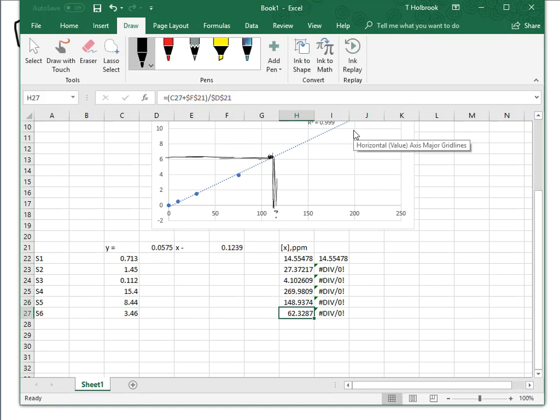All right? So don't let that catch you for a loop. Don't let that throw you off and cost you tons of points because you weren't clever enough to go in and anchor those numbers. Now, you can manually put them in. You can go down through here and manually type in that calculation every single time. Take this number, add this number, divide it by that one, hit enter. In the next one, you do the same thing. 3.46, click that number, divide by that number, hit enter. And that will give you the right answers. But it just takes a lot of time.